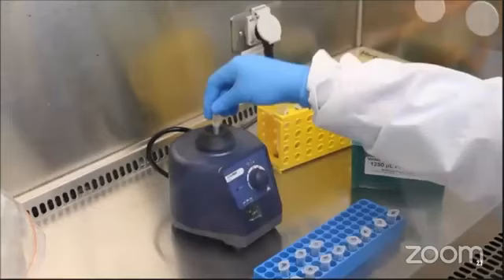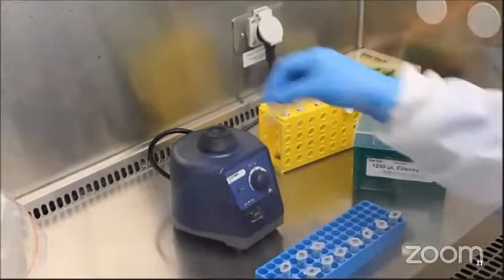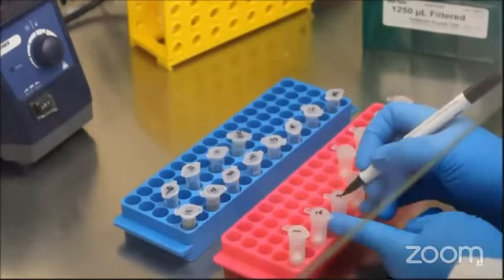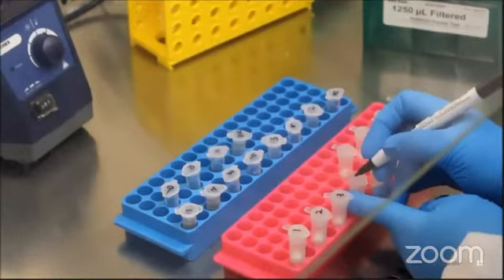After vortexing, we need to apply the samples on the column. But first of all, label the column with the identification code. This is a very important and critical step.